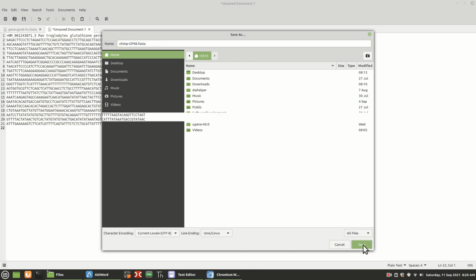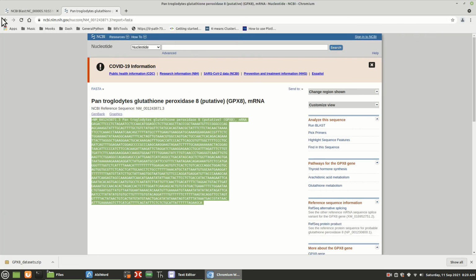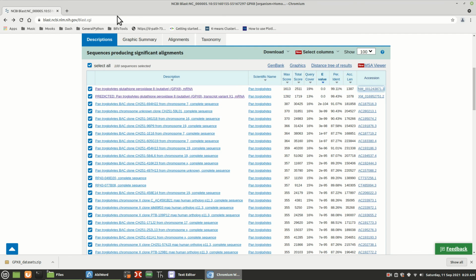In other words, let me save this real quick. What I'm saying is, when you came here, whatever's up here, this is the one with the lowest e-value and the highest percentage identity. So technically the second one has a slightly higher percentage of identity, but this one has more query coverage. That doesn't matter. But this is the highest rated one, so this is the one I got.